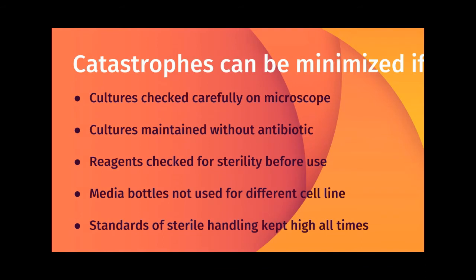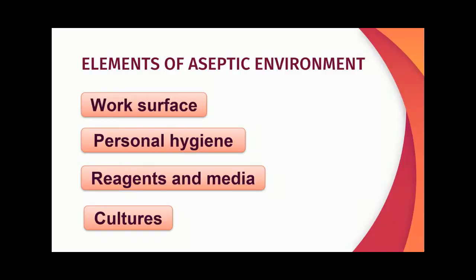Some of these catastrophes can be minimized if cultures are checked carefully under the microscope, if cultures are maintained without antibiotics, if reagents are checked for sterility before use, if media bottles are not used for different cell lines, and if standards of sterile handling are kept high at all times.